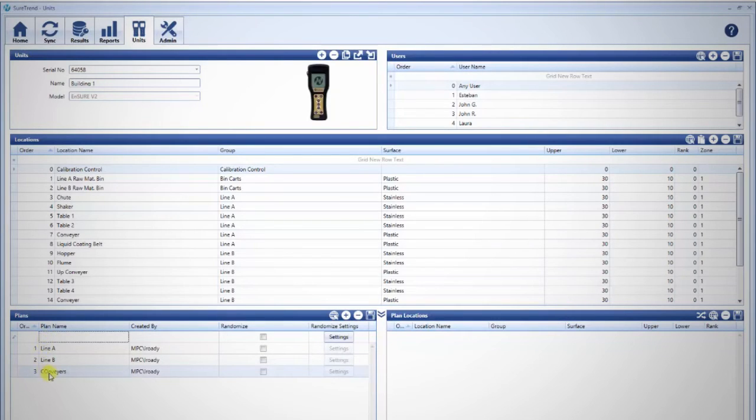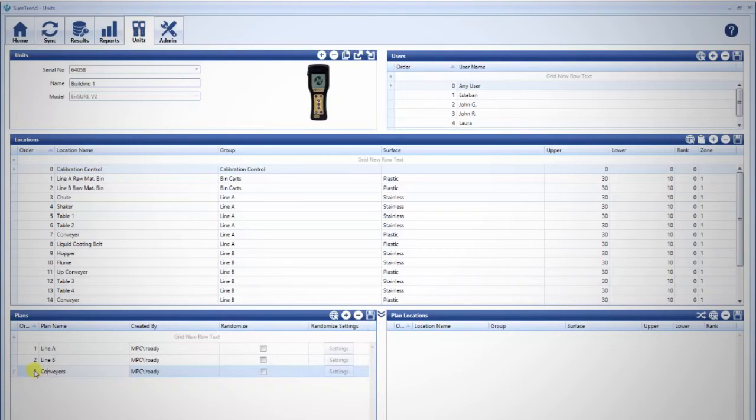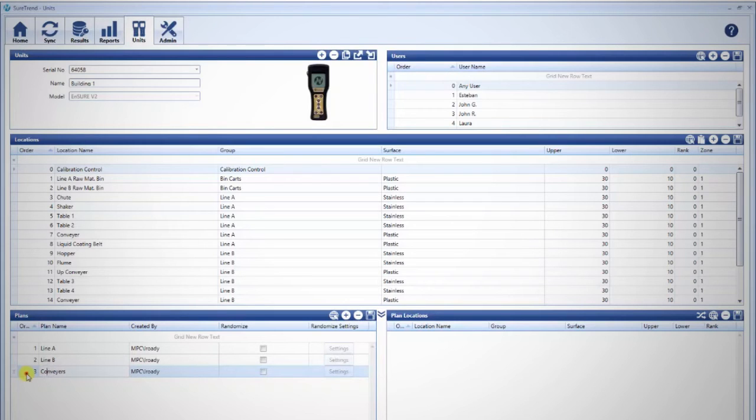Fields can be modified by clicking twice in the plan name field. Once all plans are listed, you may rearrange the order in which they will appear on the unit by clicking, holding, and dragging rows to the desired position.